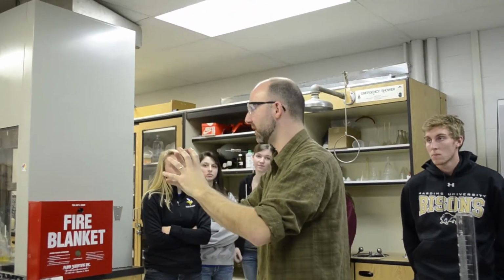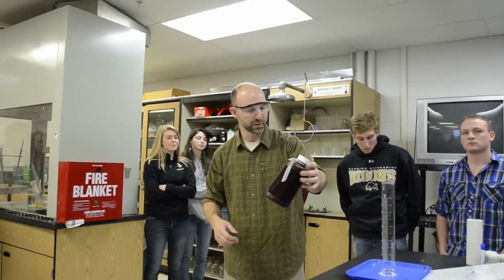An enzyme has a particular shape to it. It's a biological molecule. And the things that need to react will come together and they'll fit on the enzyme. And because they're close to each other, what can they do? They can collide. So the enzyme is a biological catalyst. Without these enzymes, you and I would not be here. There wouldn't be life. Here is hydrogen peroxide.